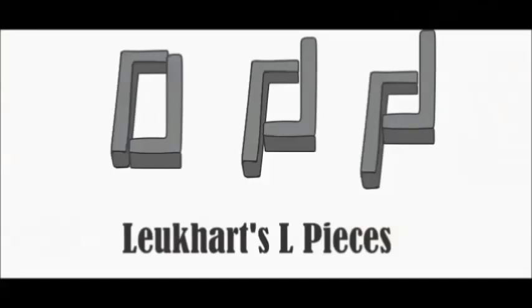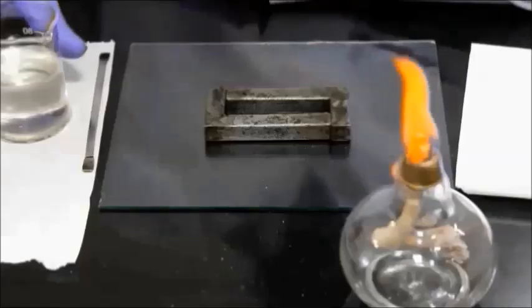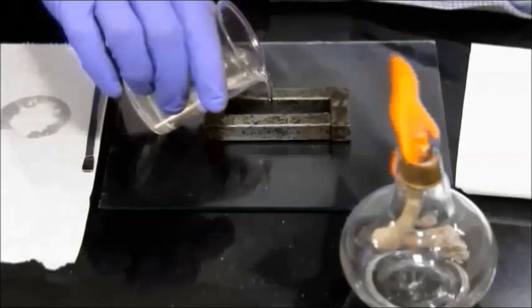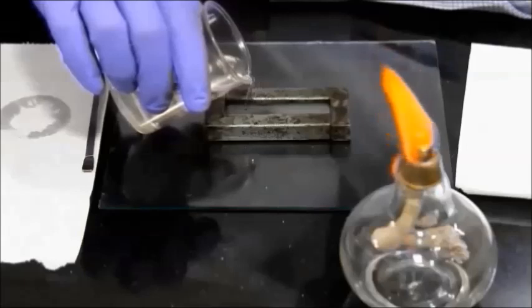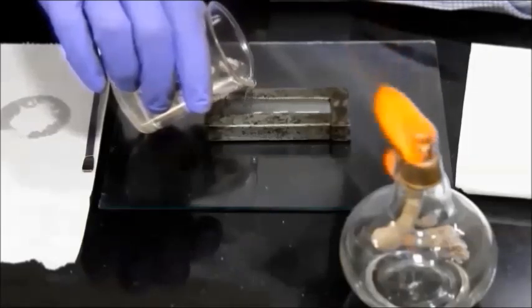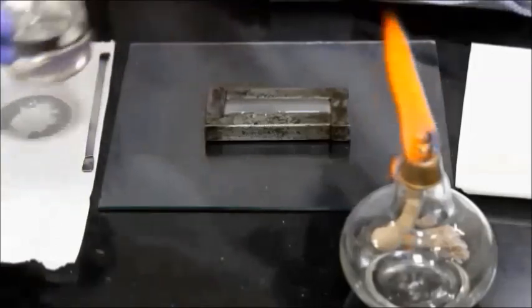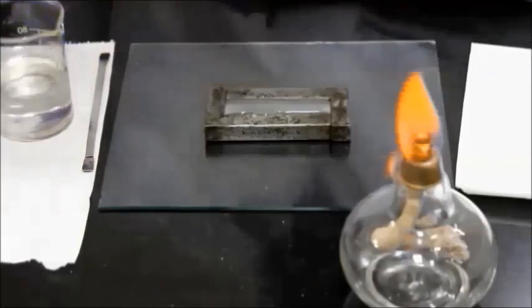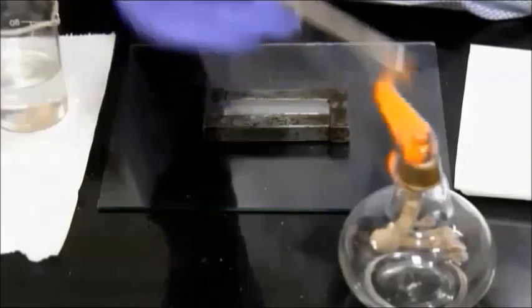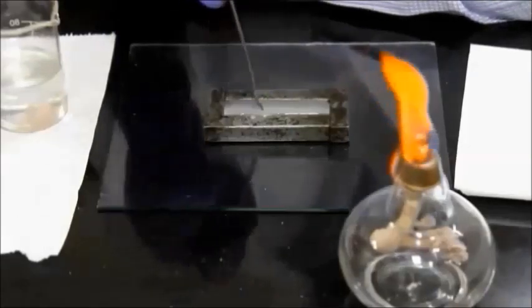Glycerol is applied on the L pieces and the bottom surface to facilitate easy separation of the wax block after solidification. The molten paraffin wax is poured between L pieces and allowed to solidify at the bottom. To avoid solidification of the surface layer, a hot dissecting spatula is slowly moved through the upper layer of wax.